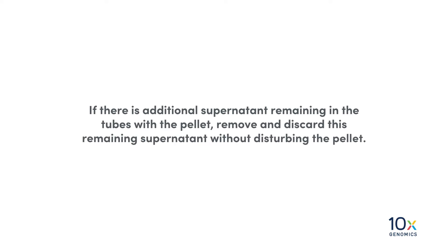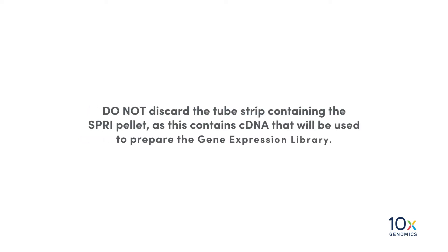If there is additional supernatant remaining in the tubes with the pellet, remove and discard this remaining supernatant without disturbing the pellet. Do not discard the tube strip containing the SprySelect pellet, as this contains cDNA that will be used to prepare the gene expression library.